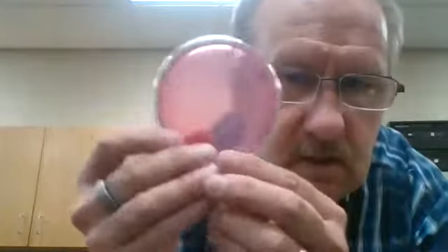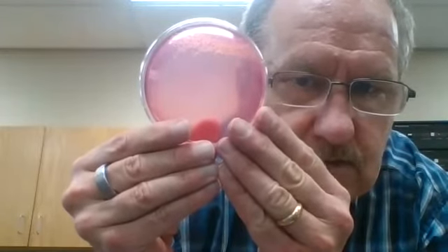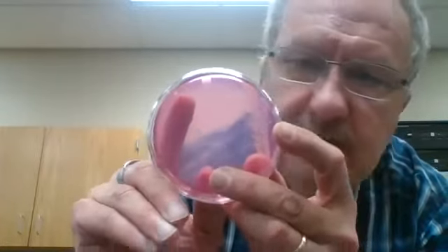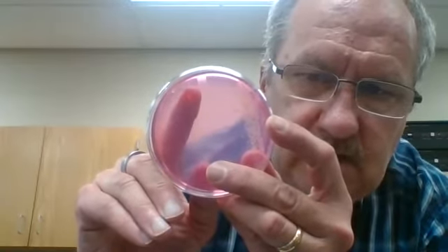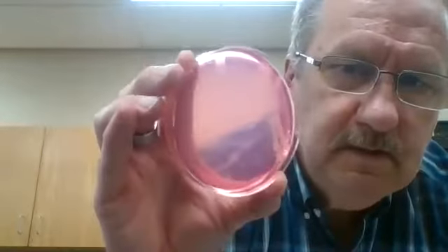Here is the petri dish — trying to get this without glare. The colonies are pretty translucent. Rather than picking three colonies from these, I'll direct you over here where you can see three colonies: one that is very close to the edge of the petri dish, and then two over there. I'm going to pick those as my colonies. It's difficult to tell the color, but they're sort of off-white — not yellow. Take this off so you can maybe see it a little bit better.